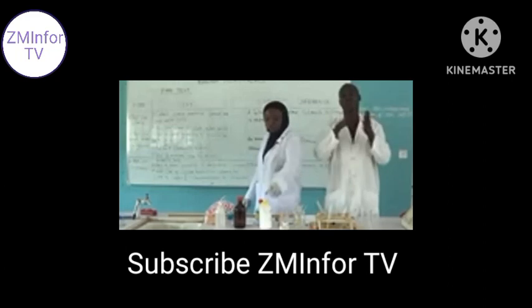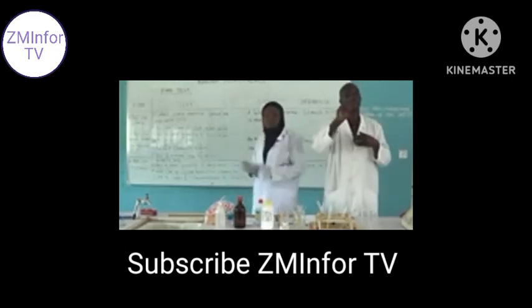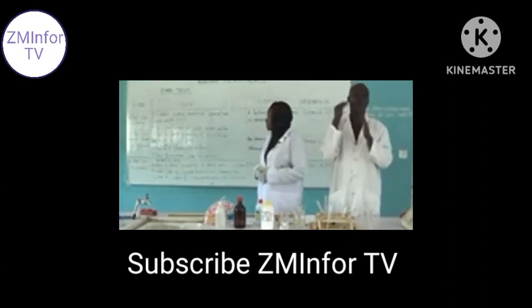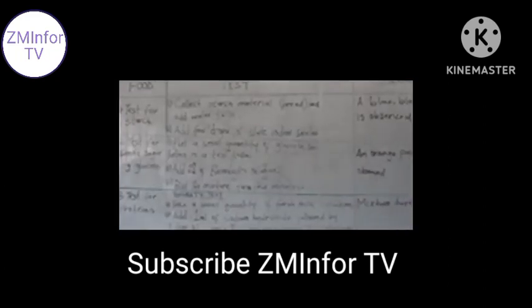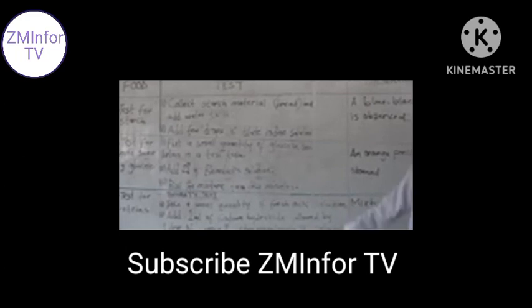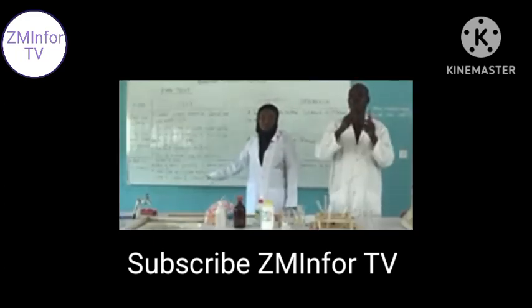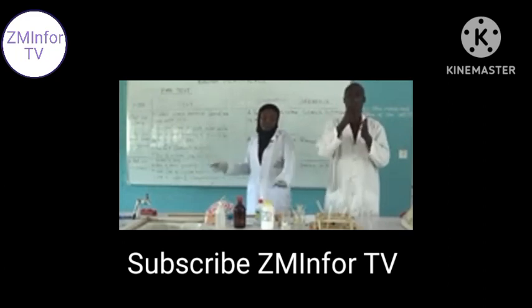So if you don't have the laboratory glucose, you can use simple cane sugar, which is very abundant in our society. We have seen the test for protein where we use fresh milk solution plus sodium hydroxide and copper 2 tetraoxosulfate 6. We have tested and we have seen the presence of these food materials in this food.